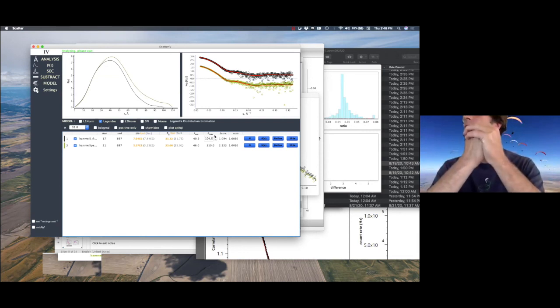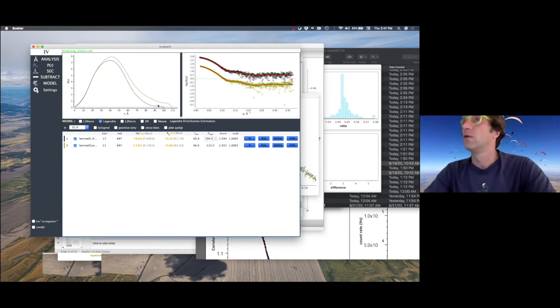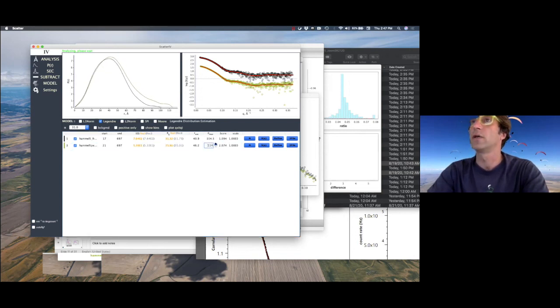Yeah. So in this case, it worked and helped us define the proper Dmax for the 110 kilodalton complex. We know the structure of this, so we kind of confirmed that the Dmax is supposed to be about 95 or 100 rather than 120 or however far you go. I mean, obviously you have this influence of the larger complex here.